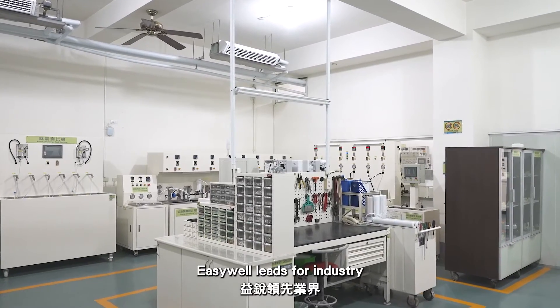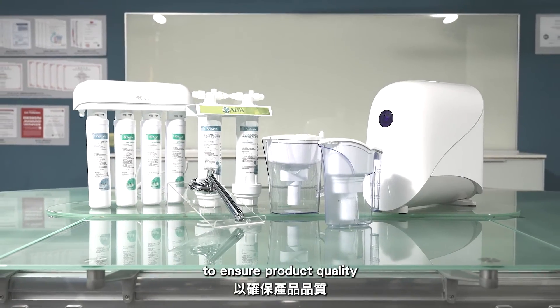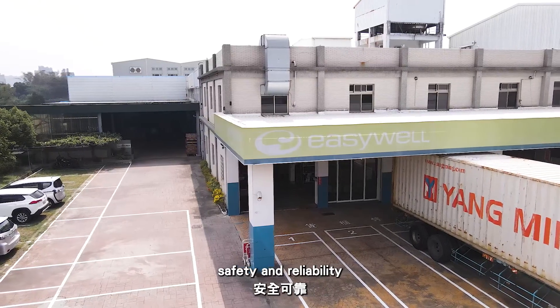EasyWell leads the industry and insists upon seeking truth from facts to uphold product quality, safety and reliability.